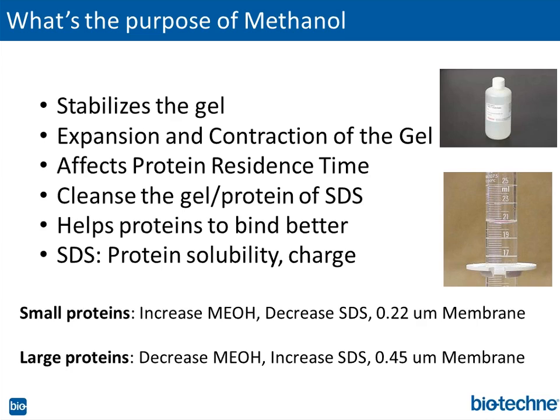Now, the second thing that methanol typically tends to do is wash out the SDS. As I mentioned earlier, nitrocellulose is not as affected by SDS, but when PVDF came out, it actually showed an interference with SDS. And by the way, PVDF is a great membrane, and I'm going to talk about PVDF a little bit later. But what you want to do is take the gel. After SDS-PAGE, you've got your bromophenol blue tracking dye, and a lot of unincorporated SDS and salts. You want to really soak the gel in the transfer buffer with the methanol to wash some of that SDS out. And that's going to get you better binding to the membrane at the end of the day.